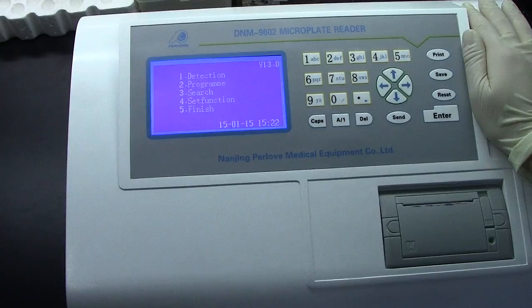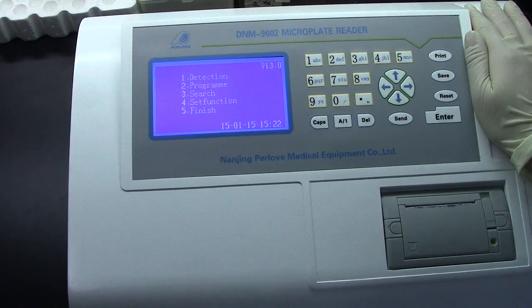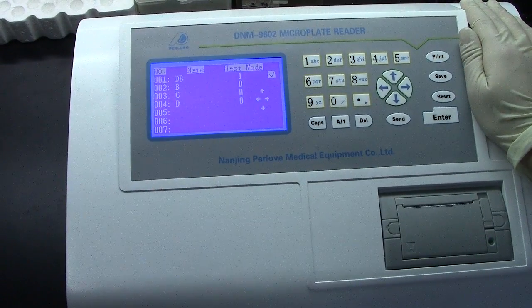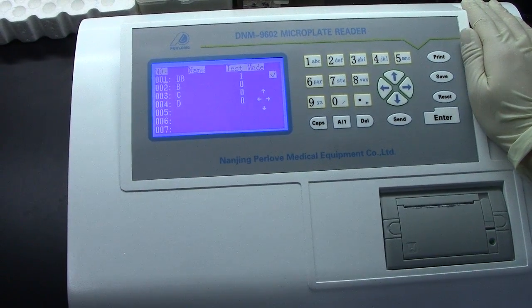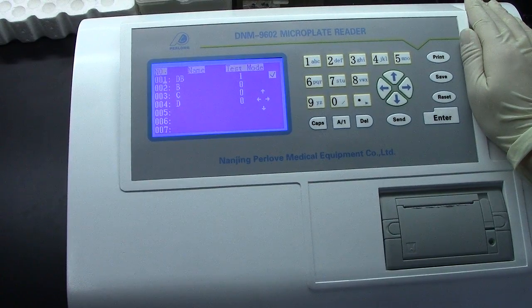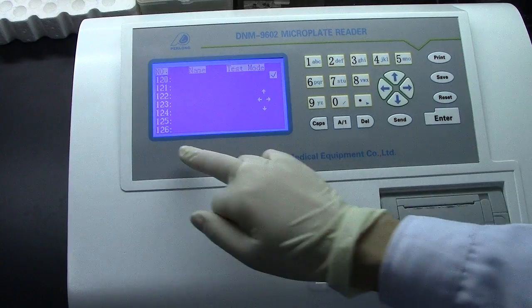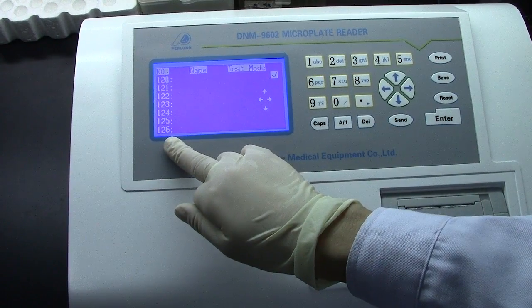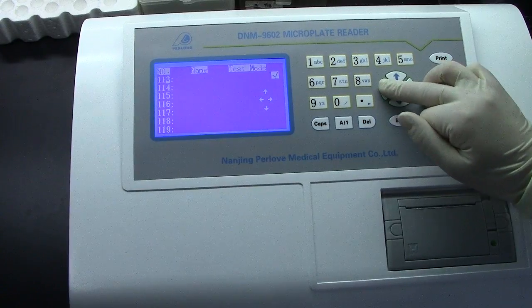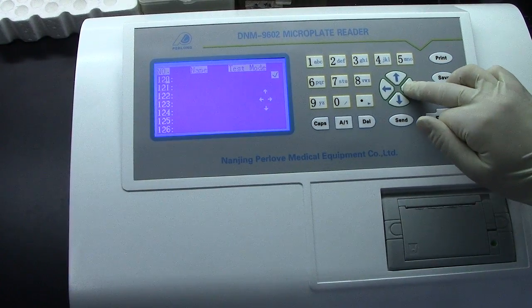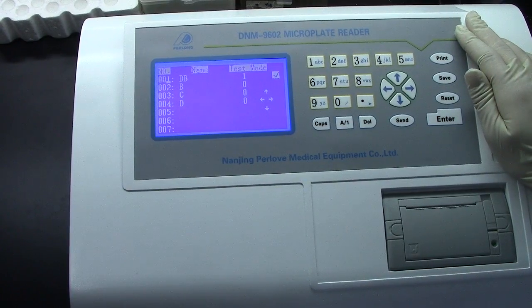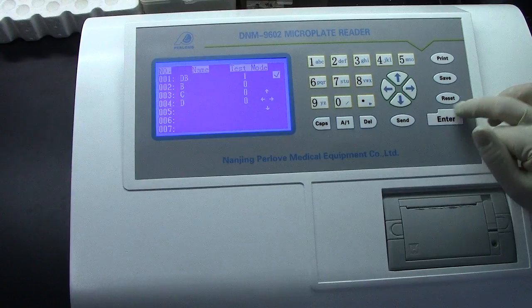We will begin from Program — press 2. For this device, we can input a total of 126 samples. You can see the last one is 126. Press this to change the page. The first page, we need to input the first program. Press Enter.